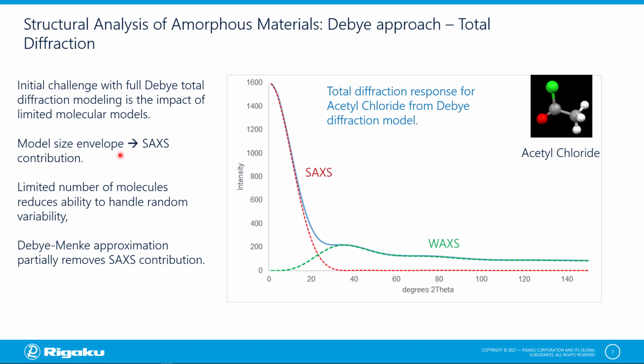So if you want to model thermal vibration in a molecule, or the effect of functional group rotation and various randomness, the only way to really do that effectively is to do the simulation multiple times with many thousands of molecules with all slightly different atomic parameters, different functional group positions. So that presents usually quite a large computational overhead. It's not so flexible as the histogram approach in terms of changing molecular models to fit measured data.